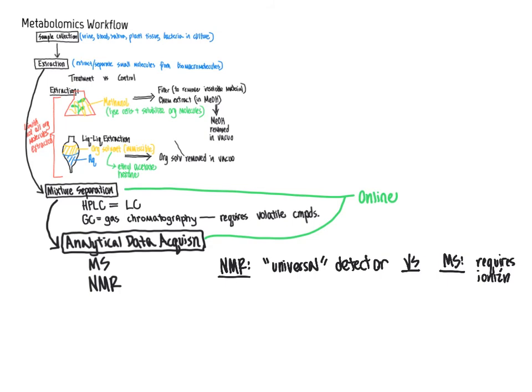Whereas NMR, if we're conducting a proton NMR experiment, is going to detect any protons within that particular sample. On the other hand, mass spectrometry has the key advantage of a superior limit of detection, which I'll abbreviate as LOD. And as a result of having a superior limit of detection relative to NMR, that implies that less sample is required.